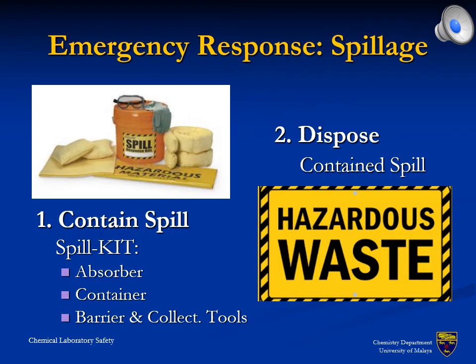Chemical spills need to be contained immediately to avoid following incidents, like fire or intoxication of people inside the laboratory. For the containment of spills, special absorbers should be used. The type of the absorber depends on the spill.